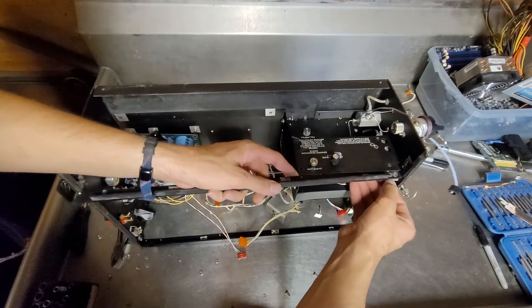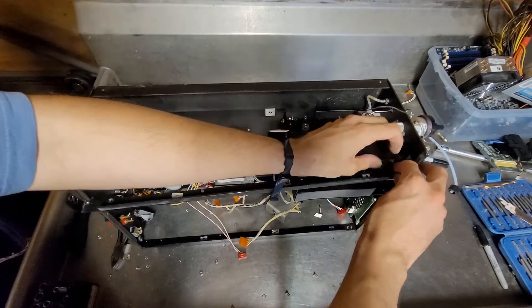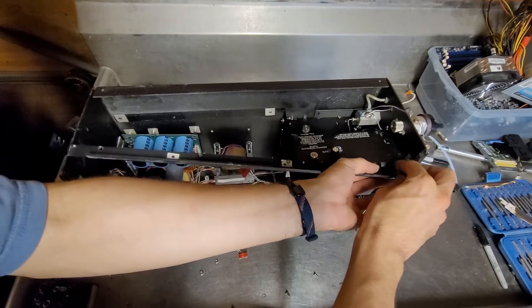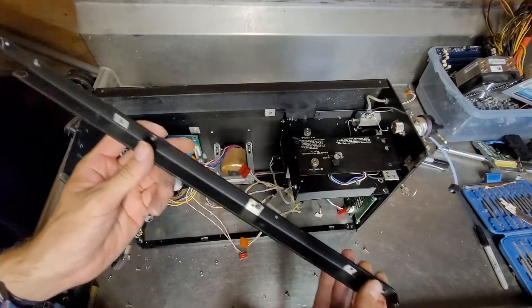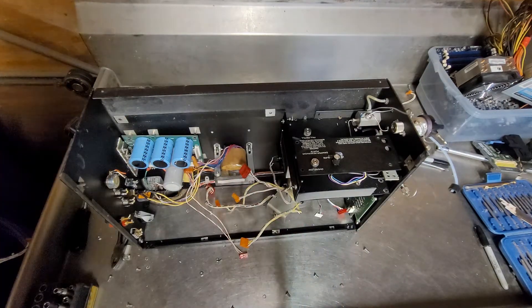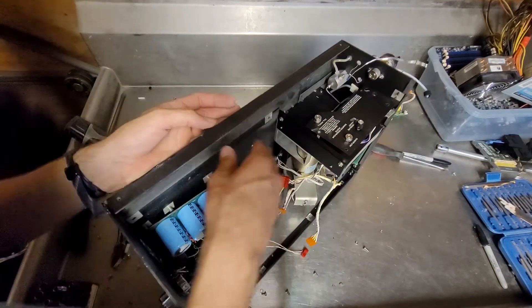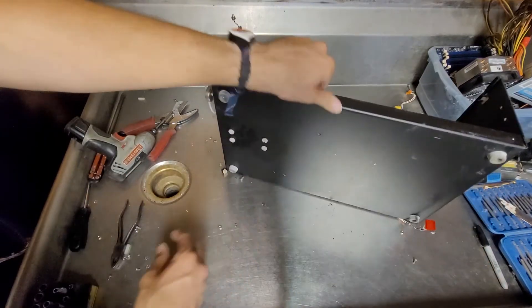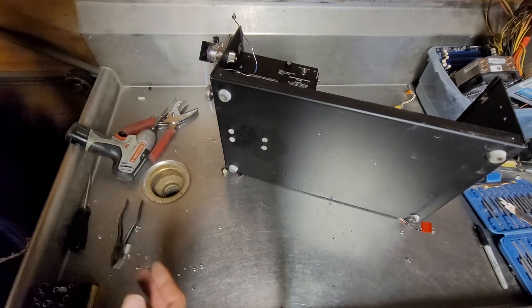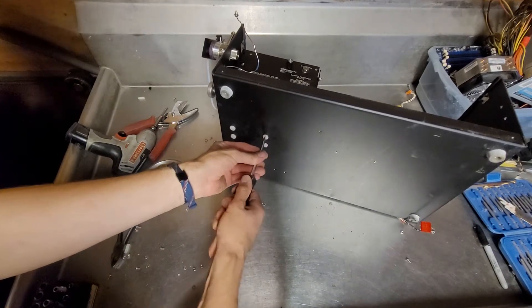Oh my goodness. The screws are binding, but I can't get them out. Another support bar down. I know there are these big, probably nylon, screws in the bottom that need to go.